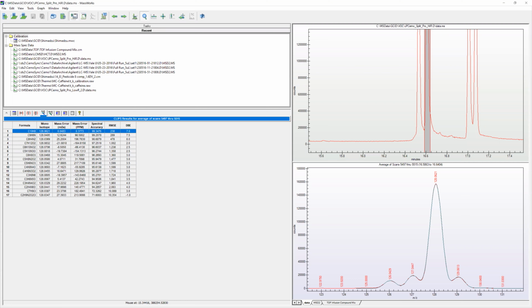So the question is, hypothetically, if my standard has many small intensity peaks and 2 high intensity peaks, how well can it identify the correct isomer of, say, 3 very similar isomers? I can take a first crack. Don, you can chip in.